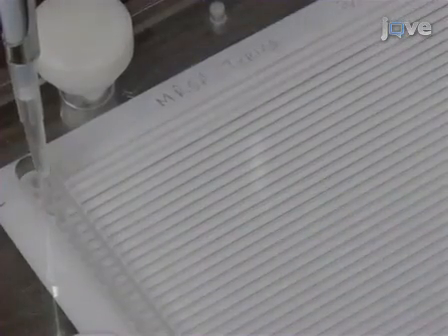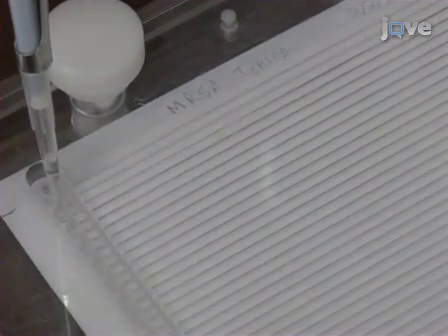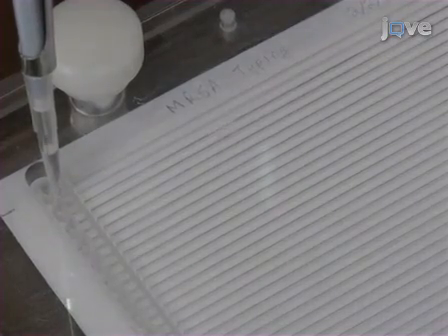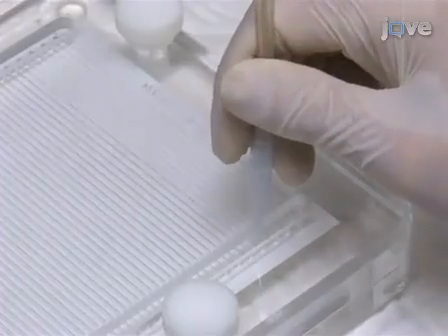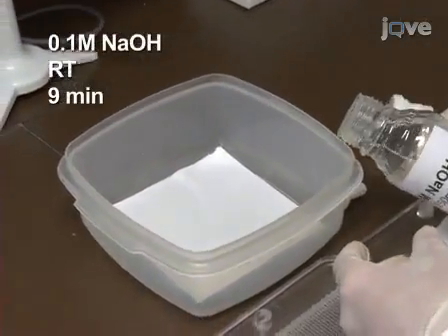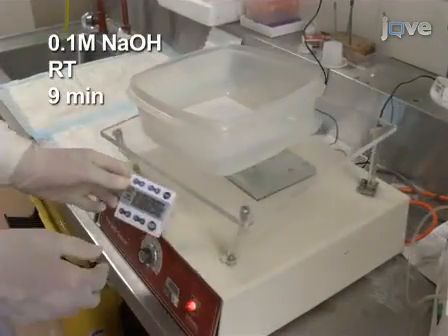If an air bubble does appear in the channel, keeping the pipette in place, rapidly aspirate the solution to allow the air bubble to float to the top of the pipette tip, then retry. Incubate at room temperature for 5 minutes. Aspirate the probe solutions, remove the membrane and wash it in 250 millilitres of 0.1 molar sodium hydroxide at room temperature for 9 minutes.